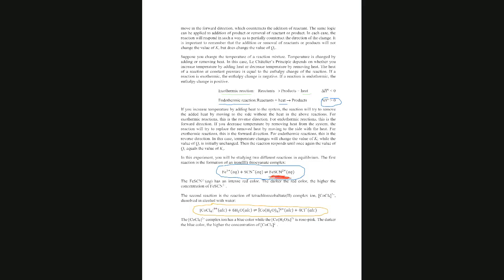What does the alk stand for? Yes, the alk is very, very important in this reaction because it has different colors. It means alcohol. Basically, what you have is this complex, the tetrachloro, this one, the tetrachlorocobaltate in alcohol is blue. This has a blue color, but only has a blue.